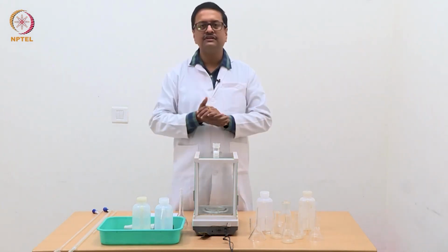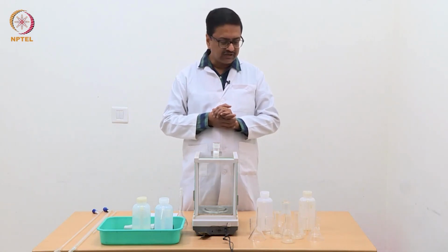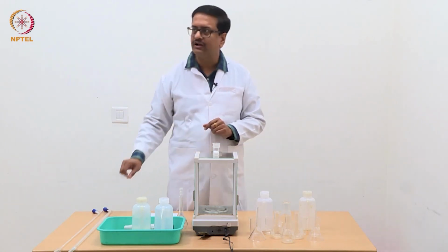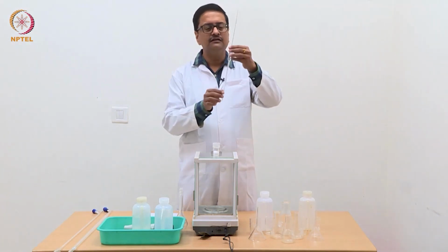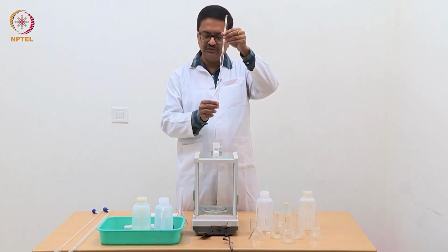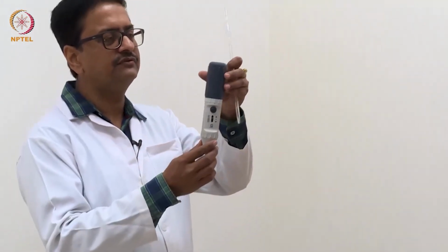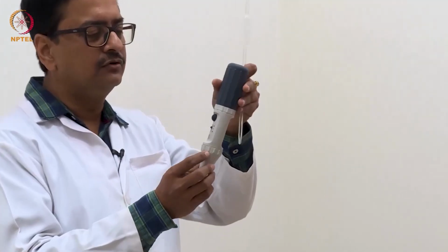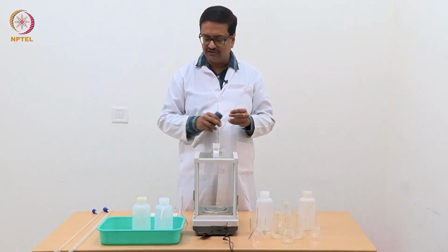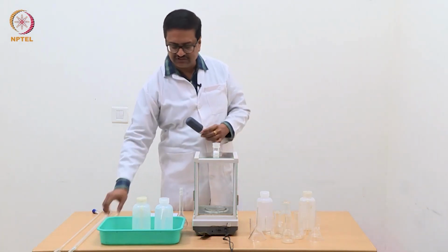In addition to this glassware, we will use many different glassware, which I will show you one by one. We will use a 10 ml pipette to pipette out the solutions, and we will use a pipette pump like this to pipette out solutions. We will not use our mouth to pipette, because that is not at all safe for anybody to pipette out solutions.